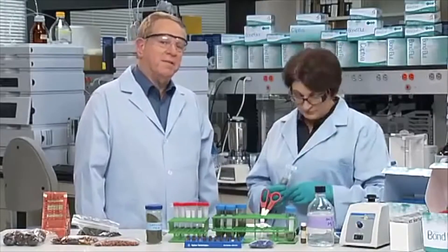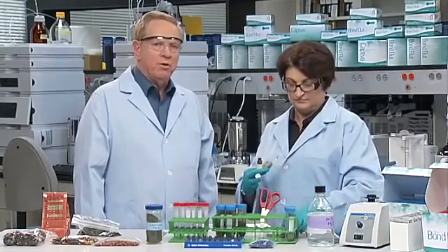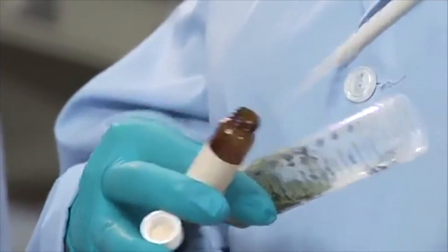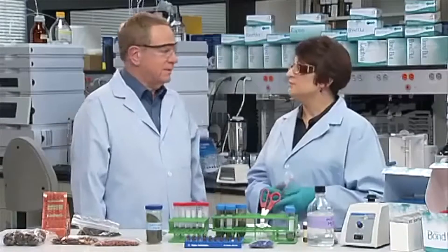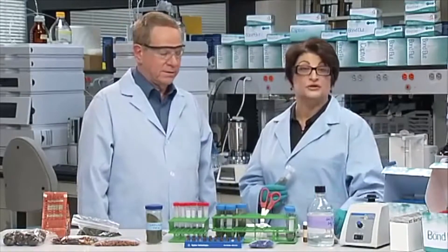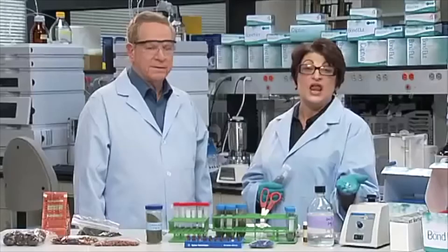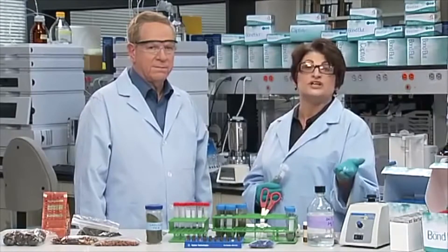That would be a good time to add the spiking solution, such as an internal standard or compound surrogates, if the sample is to be used for quality control. We suggest that when you add spiking solution, aliquot a small volume into the sample instead of a large volume. This will facilitate the incorporation of the spike solution into the sample without causing any dilution. Before vortexing the sample, we add two ceramic homogenizers. The ceramic homogenizers are inert, angular grinding weights. They promote additional homogenization of the sample and help facilitate the extraction partitioning by equalizing variances between individual shaking techniques.